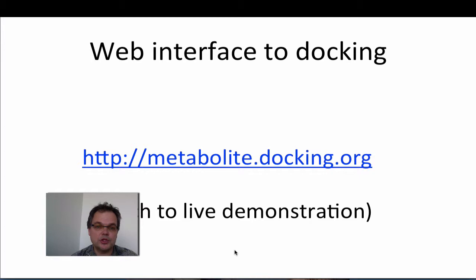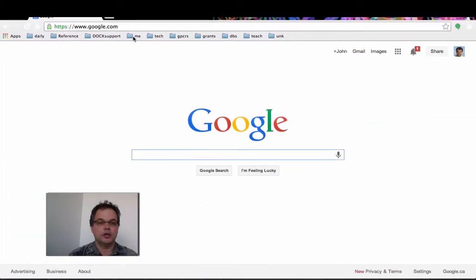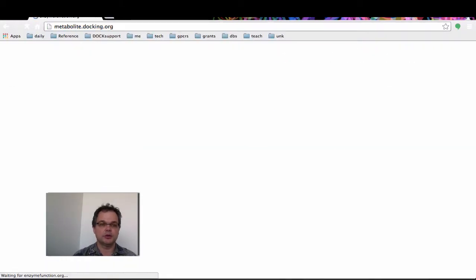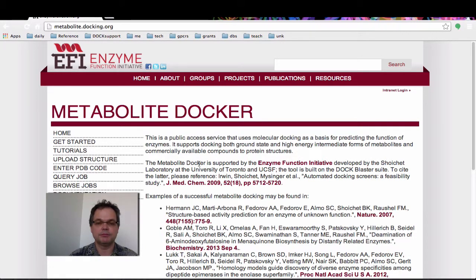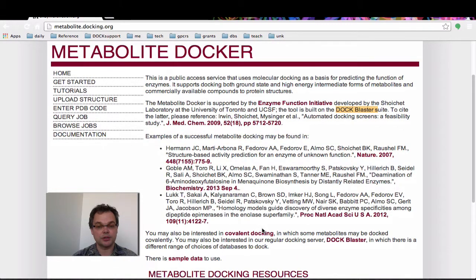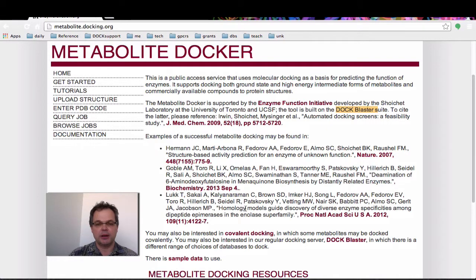I'm going to give you a demonstration of molecular docking of metabolites using the website we've set up called metabolite.docking.org. This is funded by and is part of the Enzyme Function Initiative, so it's a public service supported by EFI. It's built on DockBlaster, and here are three successful examples as templates for how you can go about this. The purpose of this website is to enable you to do the kind of work represented in those papers.